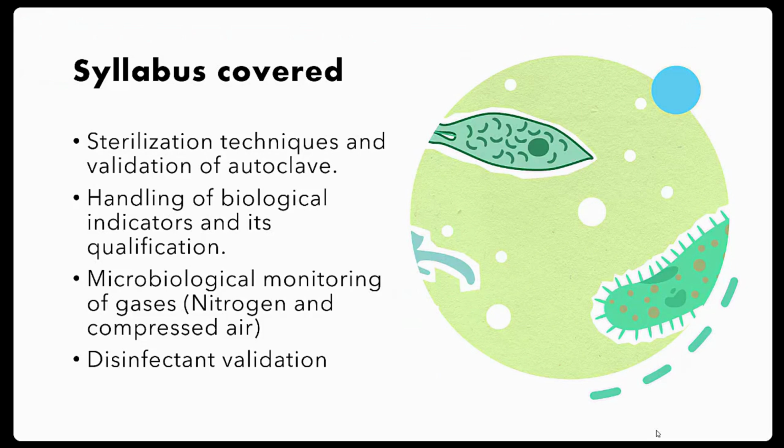In the heat sterilization, we will use moist heat, example autoclave, and dry heat, example ovens, hot air ovens. And for filtration, we will use 0.2 micron or 0.45 micron filters for removal of microorganisms. This is used in the filtration of liquid samples.